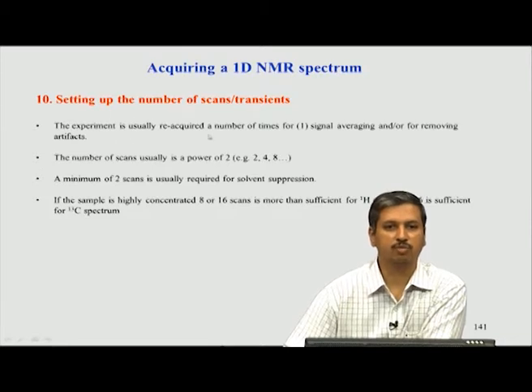Then what we come to, the more important practical point, is the scans. This is what we also call transients in NMR.